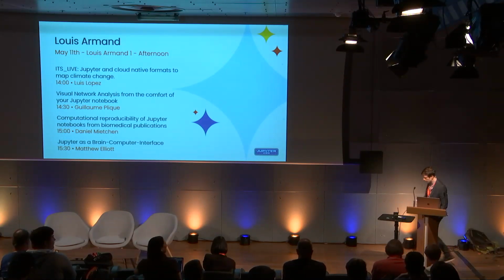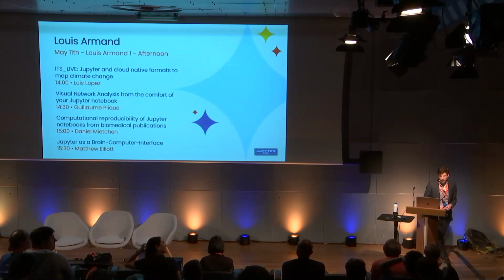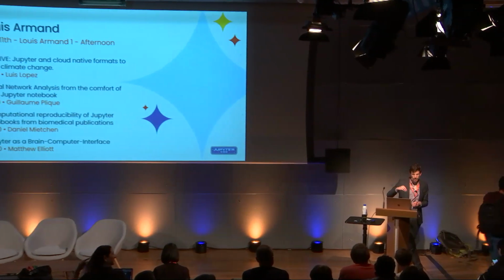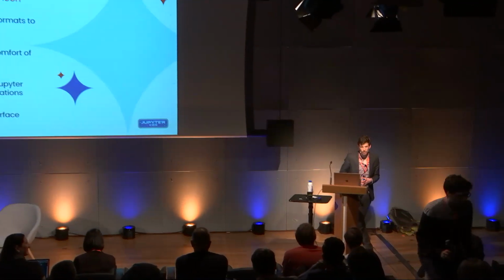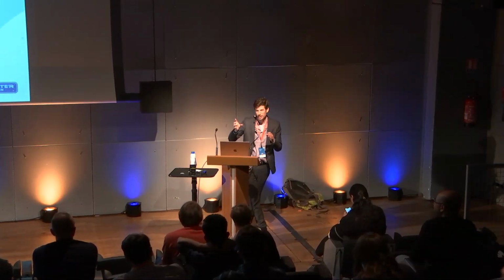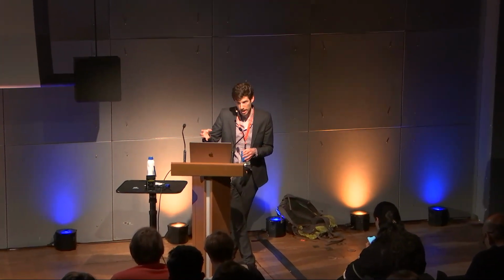Yeah. So in terms of reproducibility, the nice thing is everything we do is open source, from the electrical engineering to the hardware. So in theory, people can just reproduce it. Granted, that's a huge amount of work. But in terms of reproducing at our lab, we are growing hundreds of these things. Most people are happy if they do an ePhys, electrophysiology experiment, where it just happens once. We grow hundreds of these things. You run the same experiment hundreds of times on the tissue. So that tackles reproducibility.